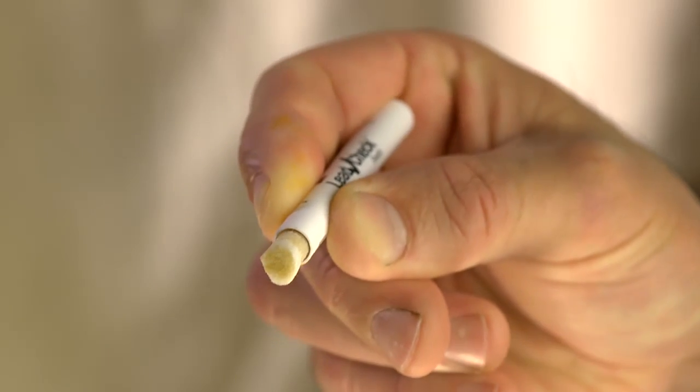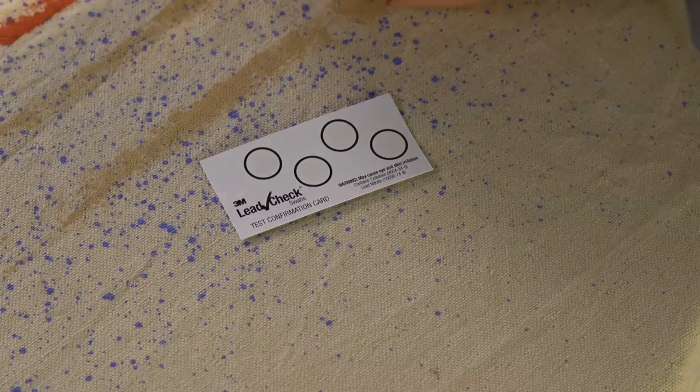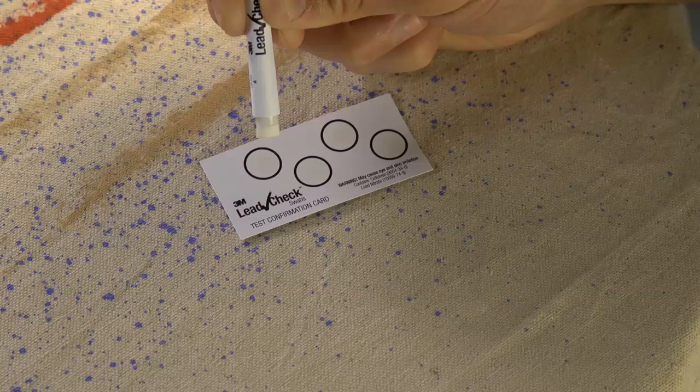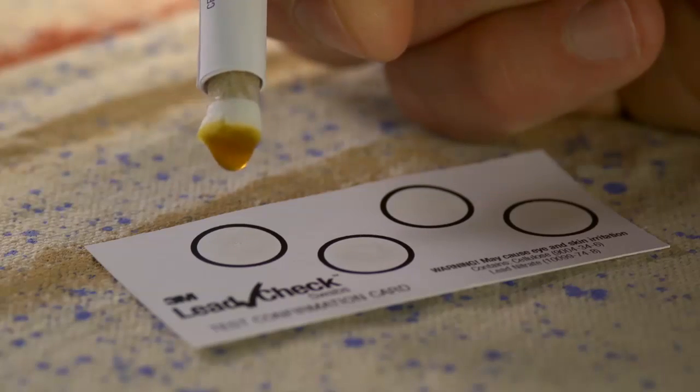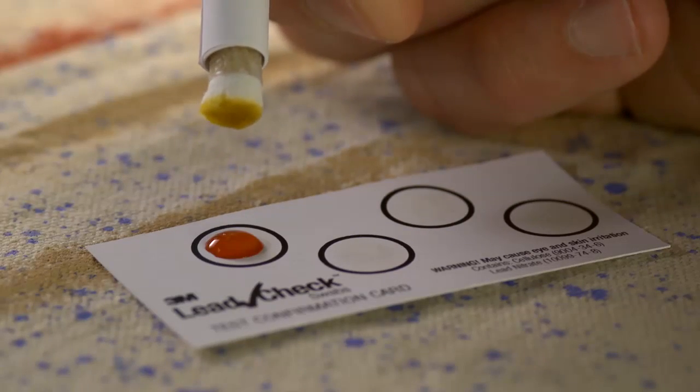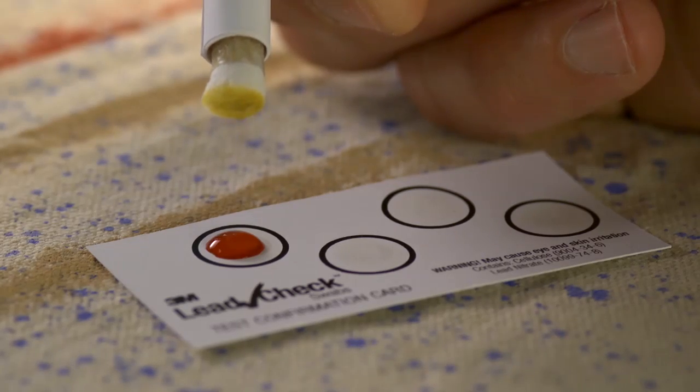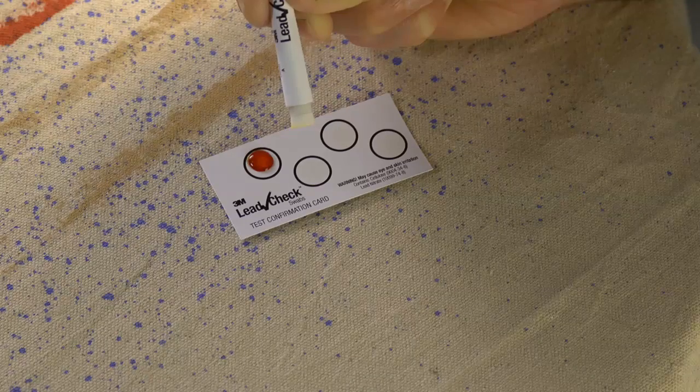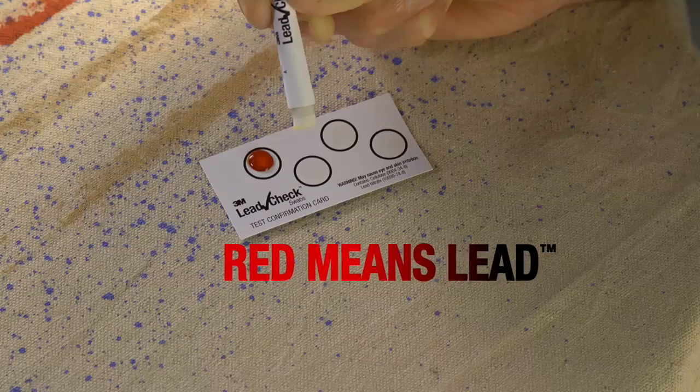If no pink or red color develops, immediately confirm the negative result by squeezing a drop of the 3M LeadCheck reagent liquid onto one of the test confirmation cards. The circle should instantly turn red. Don't forget, red means lead.